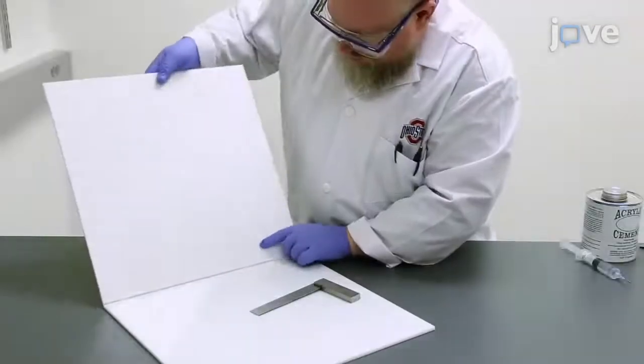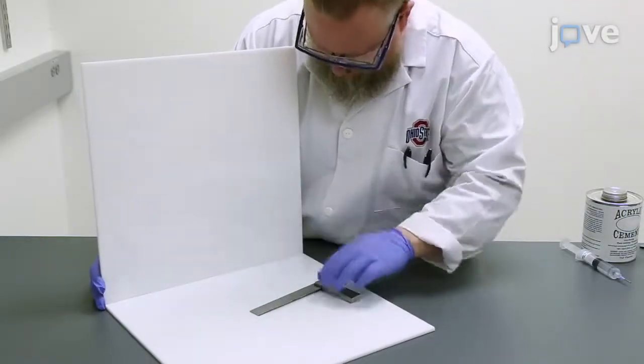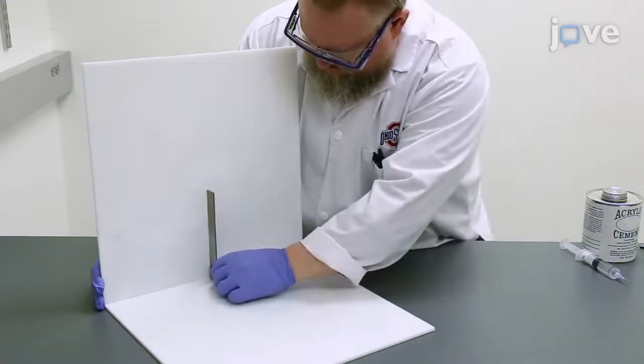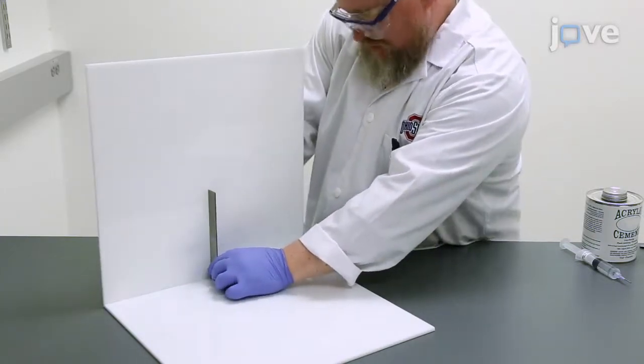Align the long edge of an outside wall with the top edge of the base, and ensure that they are perpendicular to each other using a combination or machinist square.